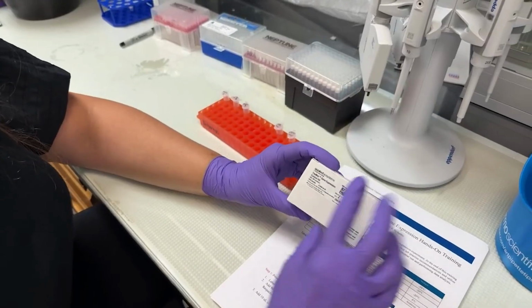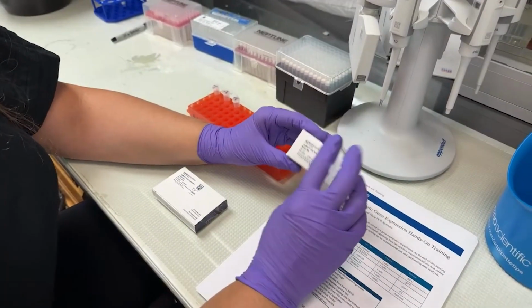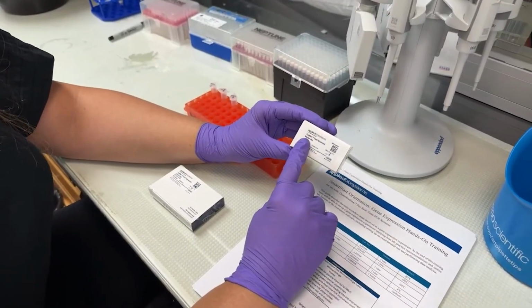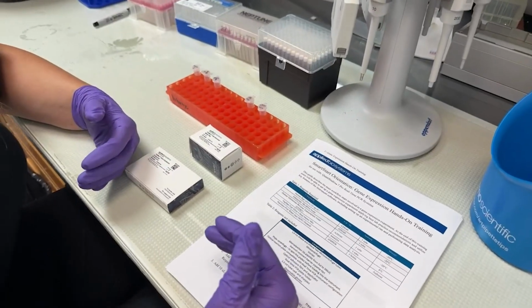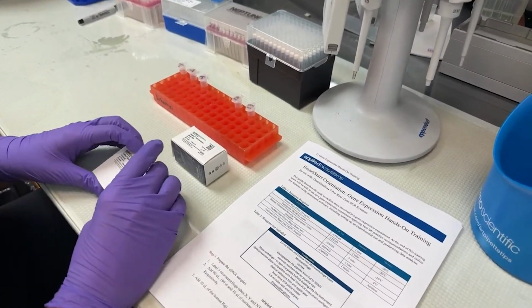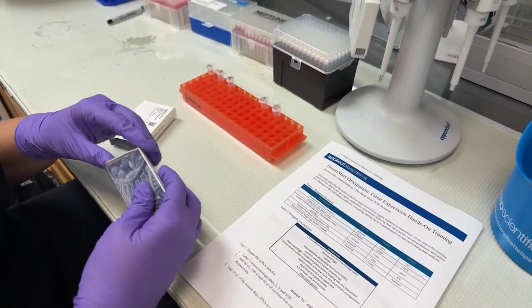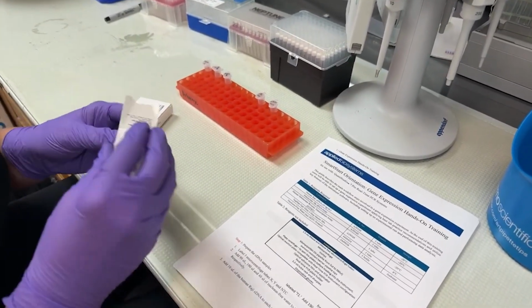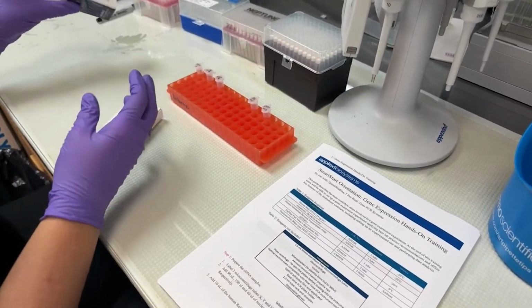So today we are going to do an experiment using a control kit, the TaqMan Gene Expression Control Kit, and TaqMan Fast Advanced Master Mix, to do an example of what a gene expression experiment is going to look like. When we were in the conference room, we talked about master mix, and this is one of our pre-formulated, one of our favorite 2X master mixes.